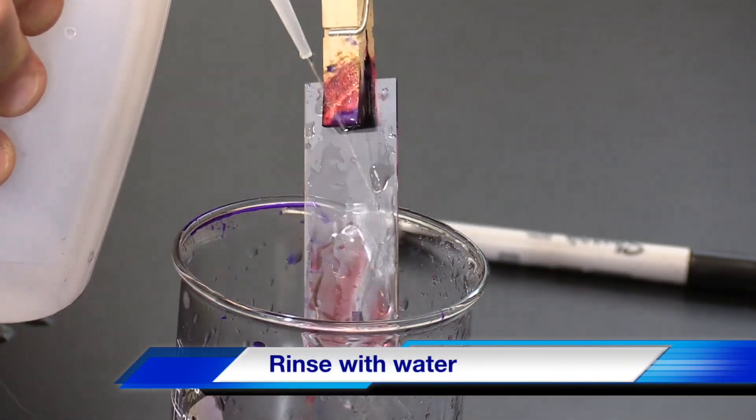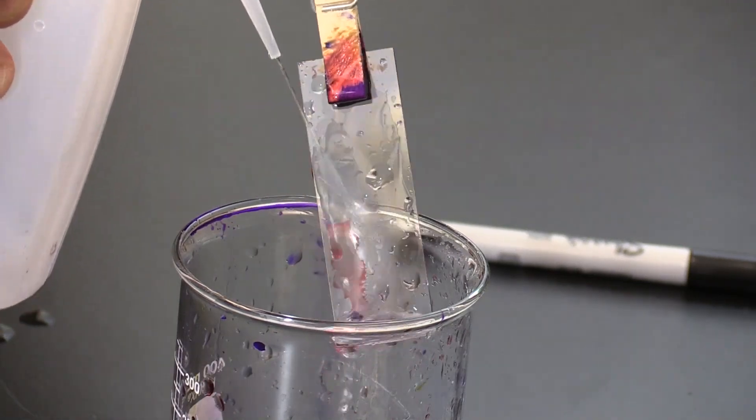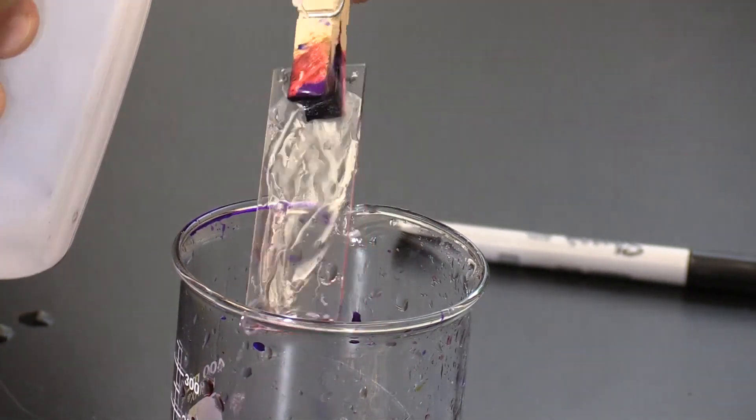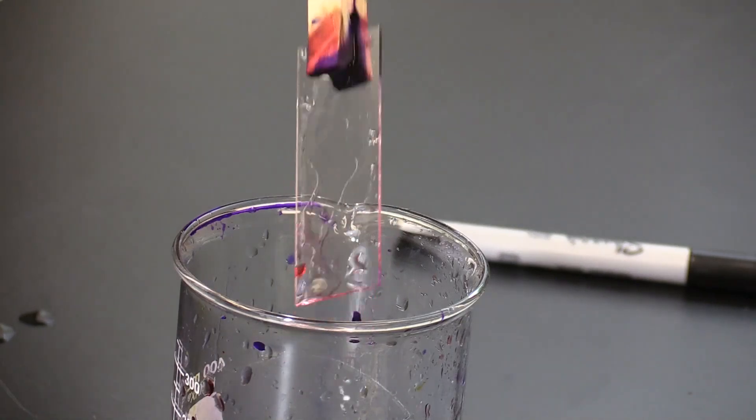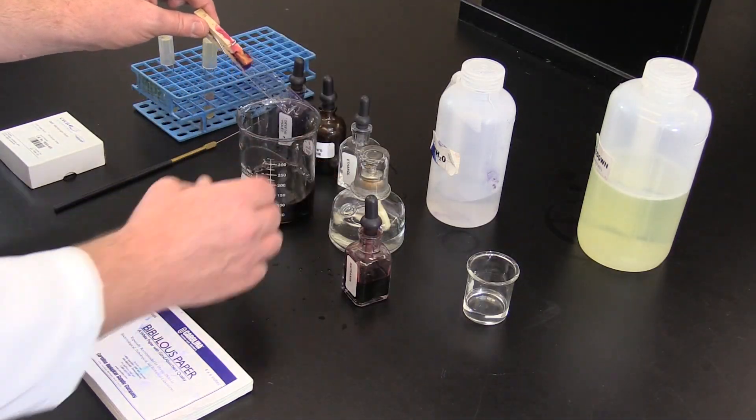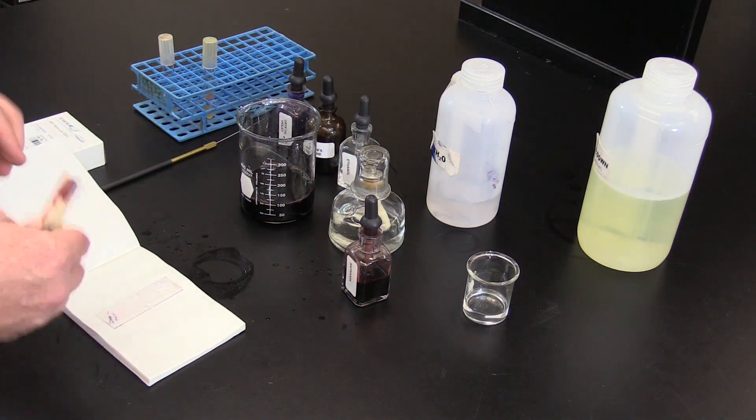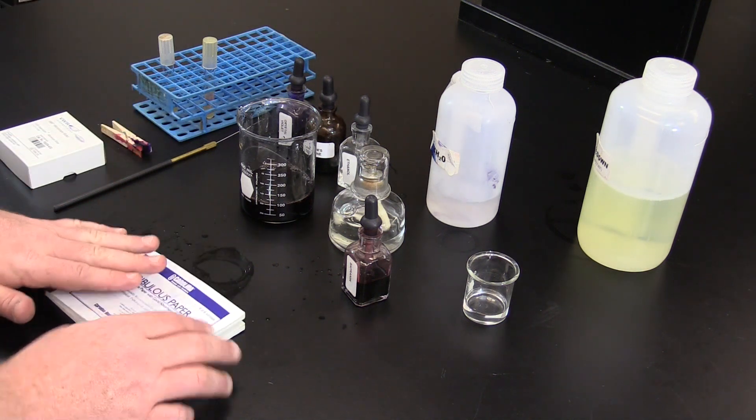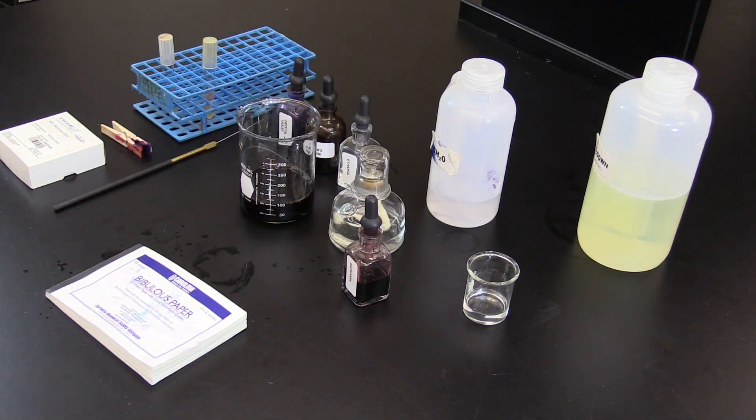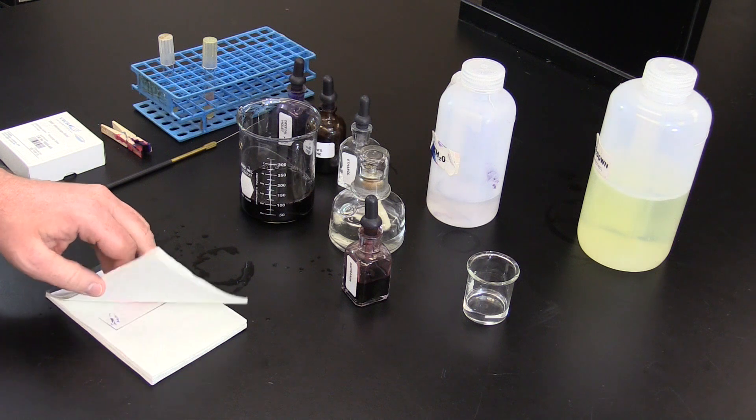Rinse the safranin away with water until the water running off the slide is clear. Now the slide needs to be dried. Place within the bibulous paper and close the booklet. Lightly press, but do not rub. Carefully remove the slide from the bibulous paper.